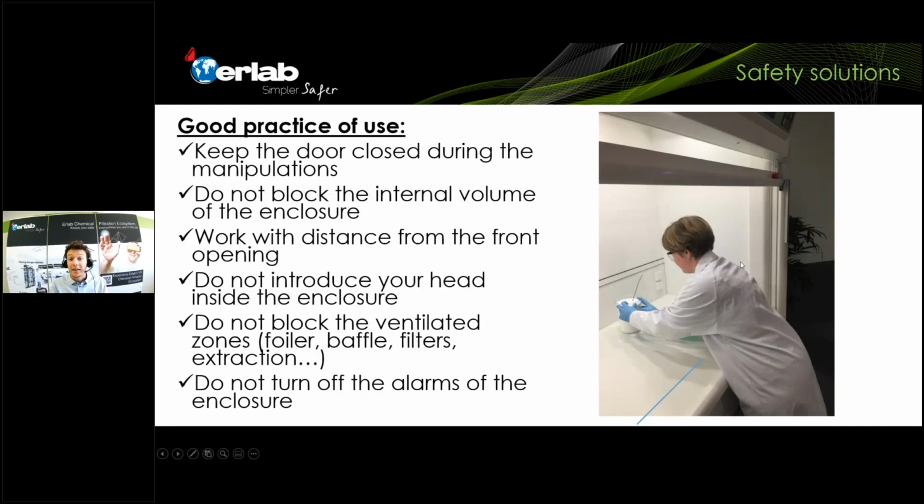So we talked about technical solutions, products, hoods that you can use in order to keep you safe. The things that you can do as from tomorrow in the lab are good practices, training, information that you give to the people who work in the lab. And that's something really interesting, and that's something that we do when we visit our customers over and over again, is just to tell them, this would be better if you do that. Those are always simple things that people are not always aware of, that they have to be reminded of, those good practices in order to work safely.